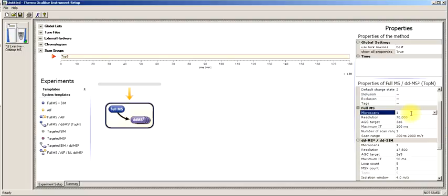Microscans, so there really is nothing micro about this. If you have 3 microscans, it's going to do 3 MS1 scans at 70,000, which take up quite a bit of time, and it's going to do those and then average that into 1 MS1 scan. In a discovery experiment, there's really no reason to do this. 70,000, as fast as the QE is, you might as well get that high resolution MS1 scan.